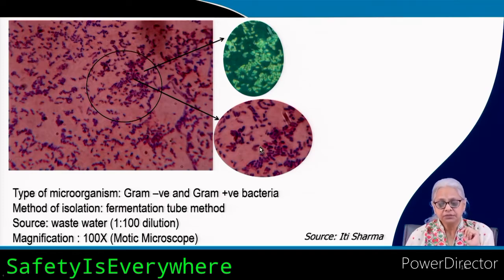So you can see the same image through the fluorescence option in the microscope will give you this kind of image, which is sometimes better. So if you have software for enumerating the bacteria, it makes it easier to differentiate the color and therefore the images and enumerate the bacteria on that basis.